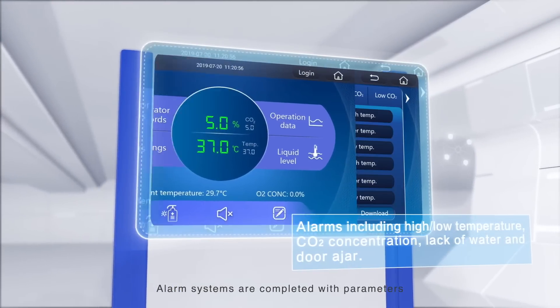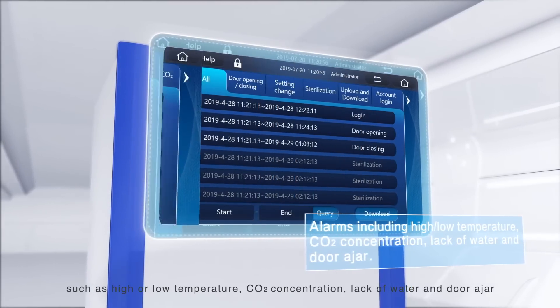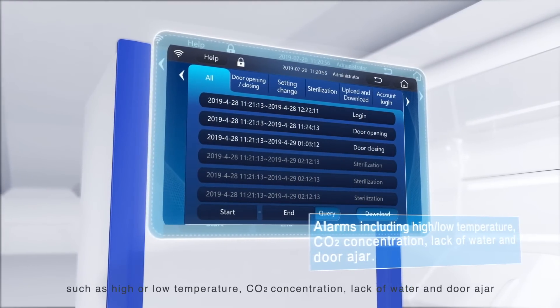Alarm systems are completed with parameters such as high or low temperature, CO2 concentration, lack of water, and door ajar.